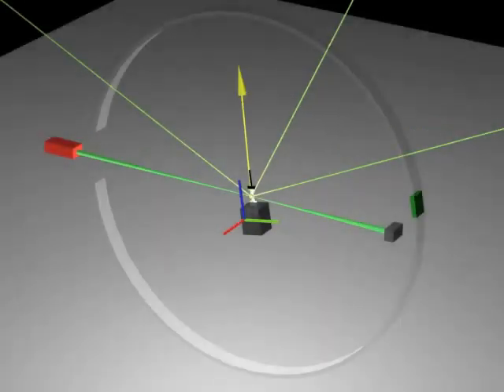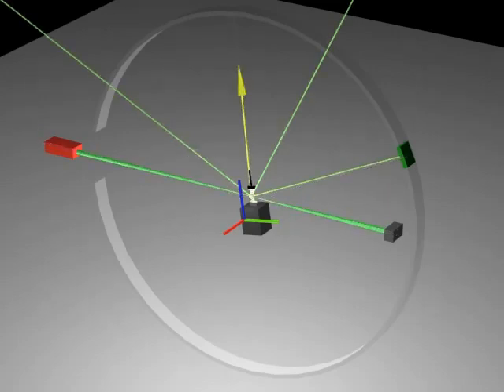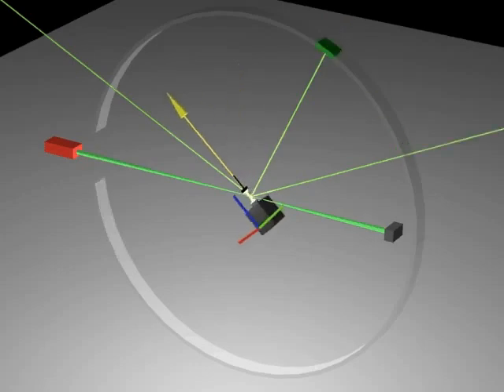To perform a measurement, the detector is swept through 2 theta until it measures a diffracted beam. Recall that the Bragg angle, theta, is determined by the associated plane spacing and the beam wavelength. To collect data for a different set of crystallographic planes aligned with the same sample direction, both the load frame and the detector must be rotated.